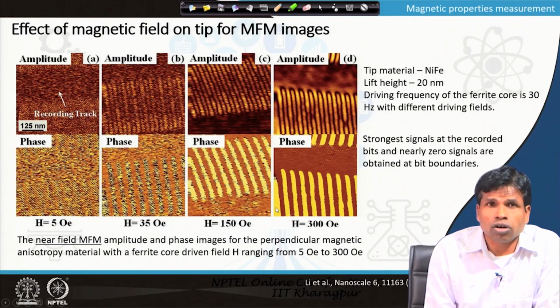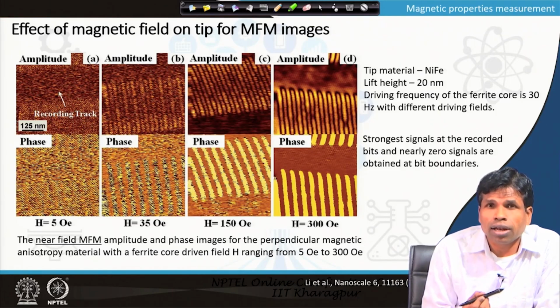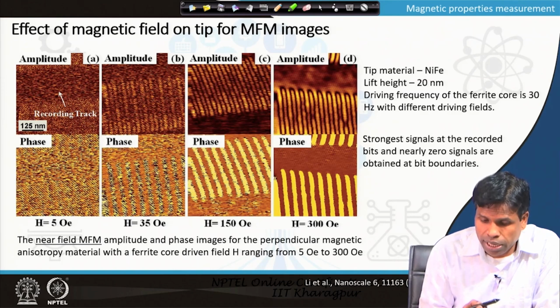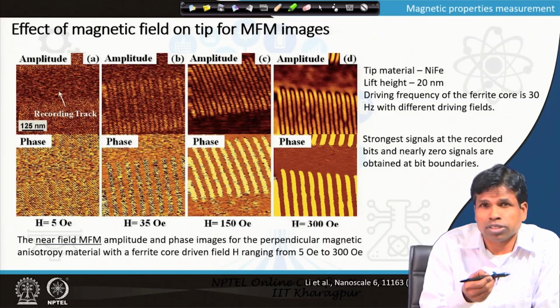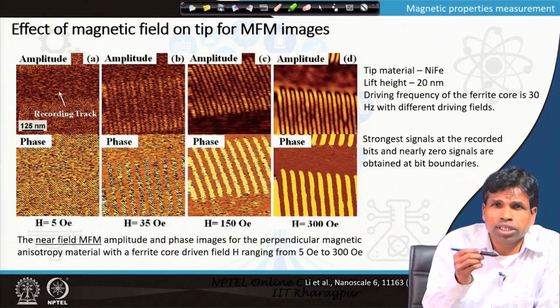One sometimes can also do more to it, like for example, another type of magnetic field, an oscillating magnetic field, can be applied below the surface of the sample, and then one can do the measurements with a small gap between the tip and sample.